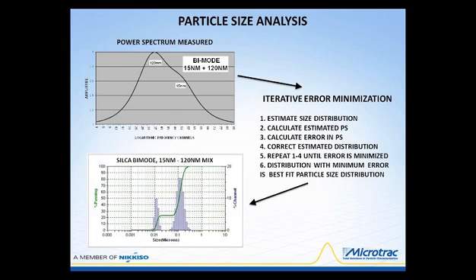And the data shown here shows that the power spectrum of the mixed mode will result in a particle size distribution that represents the two sizes of the particles and the relative concentration of the two particles. This is in a form that is using just the signal level that is generated. That can be corrected to give you actual volume ratio with the known scattering efficiency of that size particle.